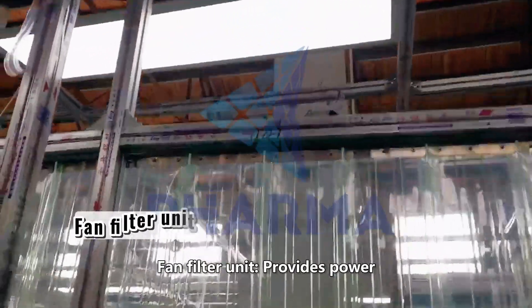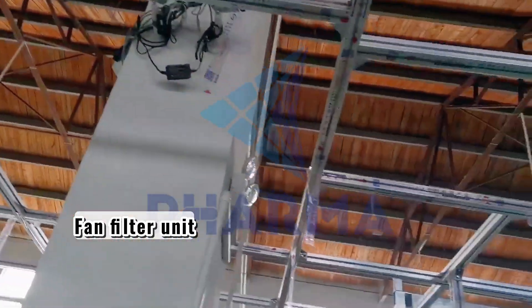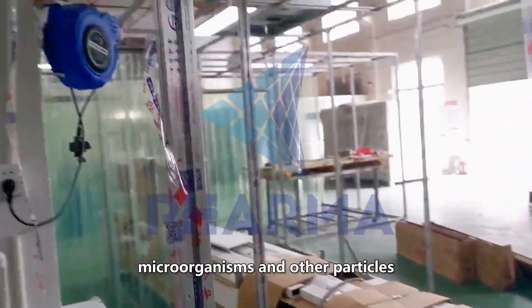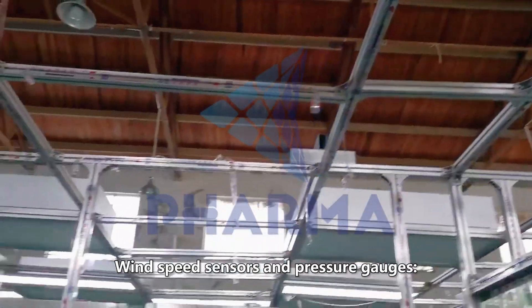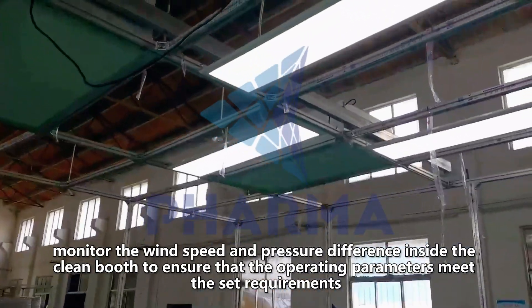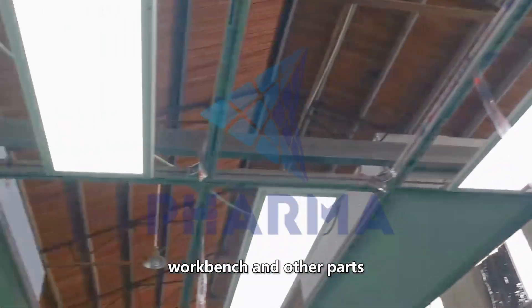The air filtration system includes a fan filter unit that provides power, drives air through filters, and maintains positive pressure and airflow circulation inside the clean room. An efficient filter installed on the top or side of the clean booth filters the air entering, removes dust, microorganisms, and other particles, and ensures the required cleanliness level. Wind speed sensors and pressure gauges monitor the wind speed and pressure difference inside the clean booth to ensure operating parameters meet set requirements, along with floor decoration, lighting system, electrical outlet switch, workbench, and other parts.